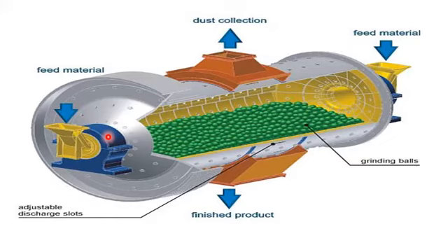So please note that in a simple ball milling apparatus, at small scale in labs, the ratio of ball to powder is around 2 to 1. However, this ratio may vary between 10 to 1 and 20 to 1, but it depends on the material which we want to crush in a ball milling machine.